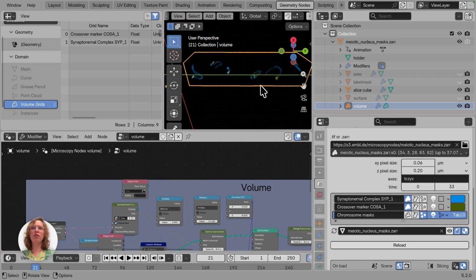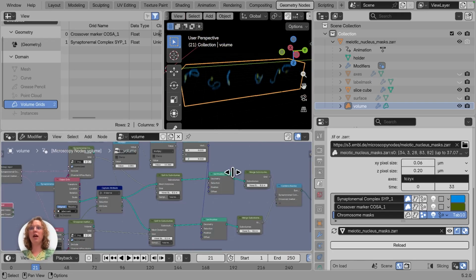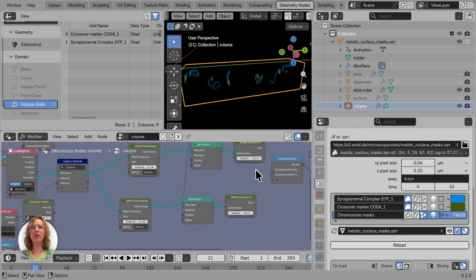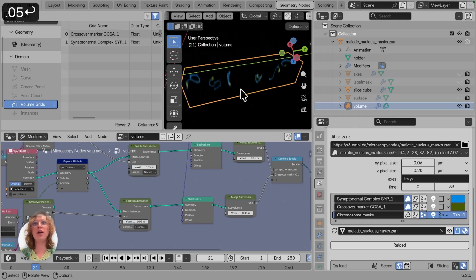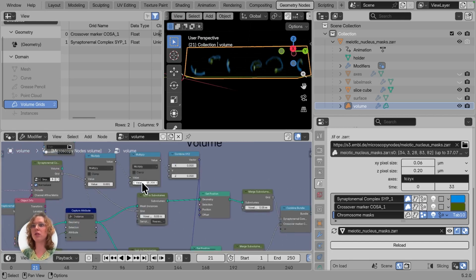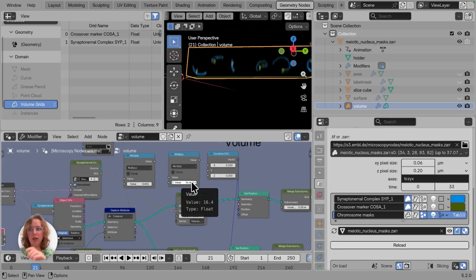So I hope this is helpful, and I hope that people can use this. Again, there is the point where this essentially will make a giant grid at the end, so once you're kind of done, I would set the voxel sizes even smaller so that you know that you're not distorting your data, but this can make everything a bit slow to work with, so I would do that only at the end. And especially with larger volumes, this will take a little bit more time.